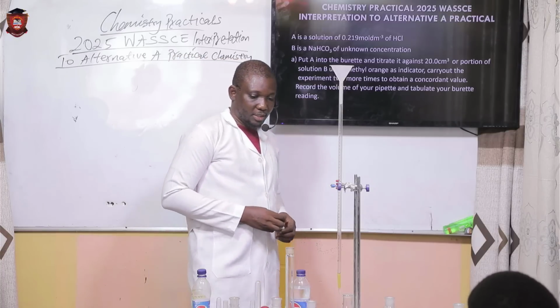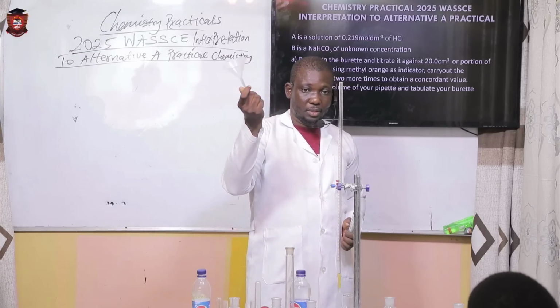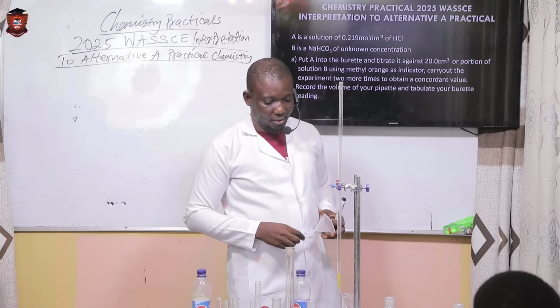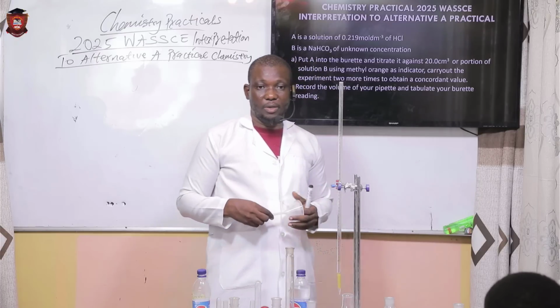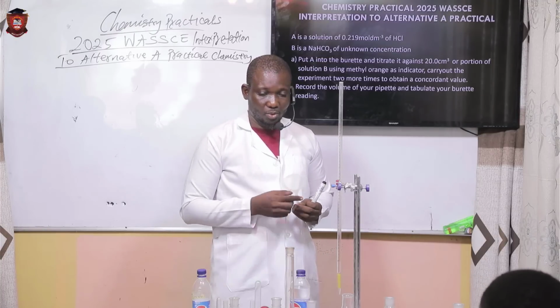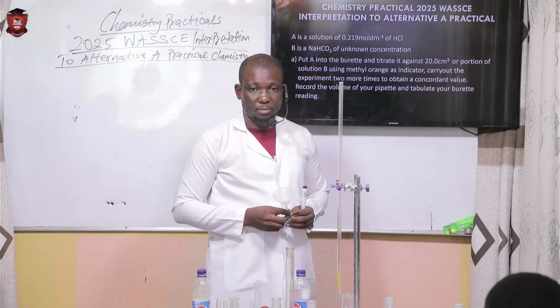Okay, I think some of these things here are familiar to us, like the one we have here. I think you know what this is. What is this? This is your funnel. Some are made of glass, but what we are using in this video is a plastic funnel. So our funnel is going to act as our delivery tube. Supposing we want to deliver any reagents, we use it to make sure no part of the solution is wasted. So we use it to deliver solutions, either here or in the test tube.